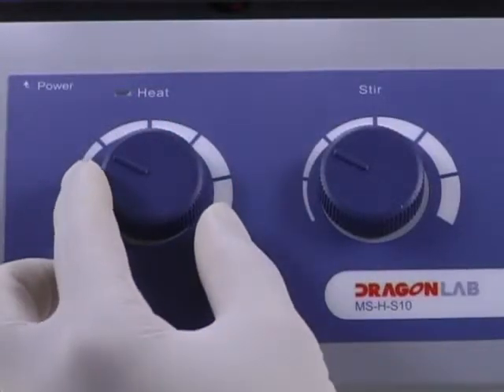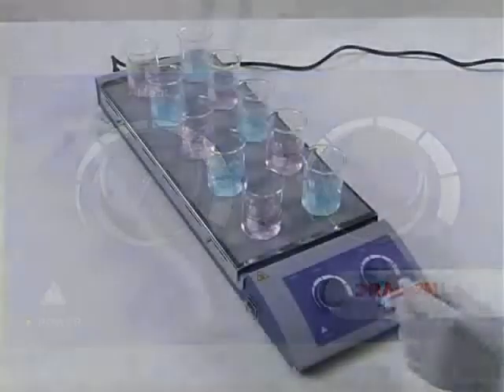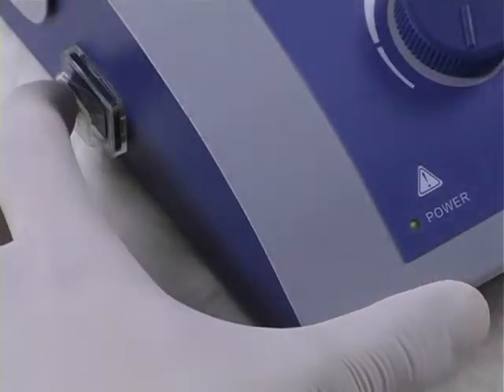When the work is over, turn the temperature control knob slowly to the lowest position. Then turn off the power device.